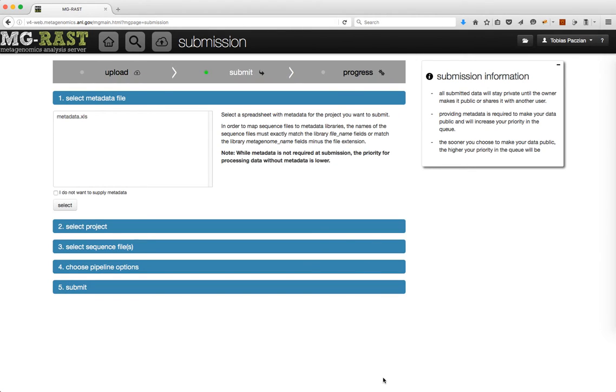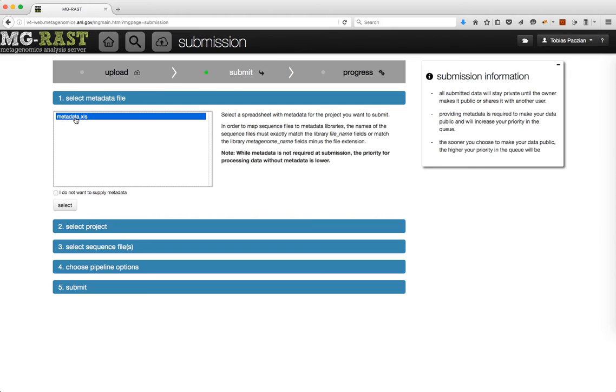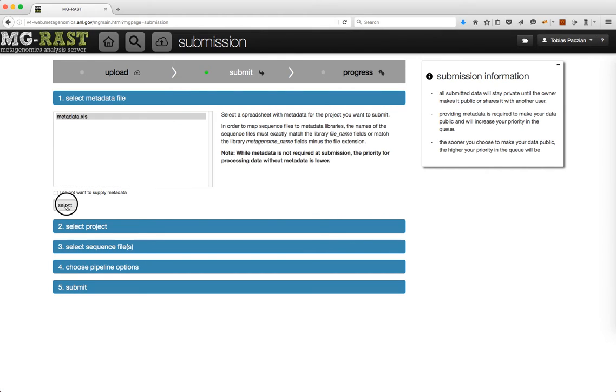To be able to submit, you must complete the five steps listed here. First, select a metadata file and click Select. If you do not want to provide metadata, click the checkbox and click Select. Note that not providing metadata lowers your priority in the queue.